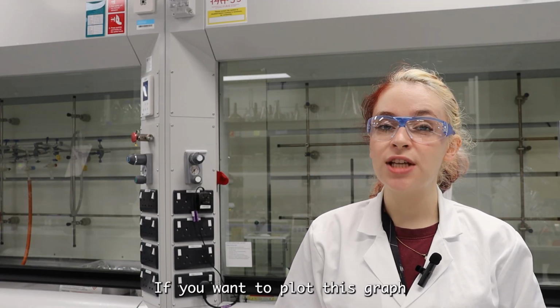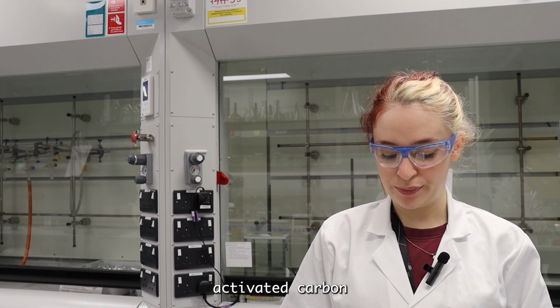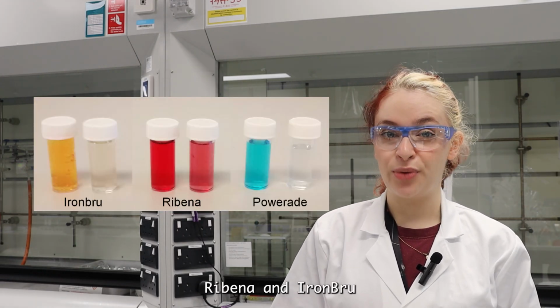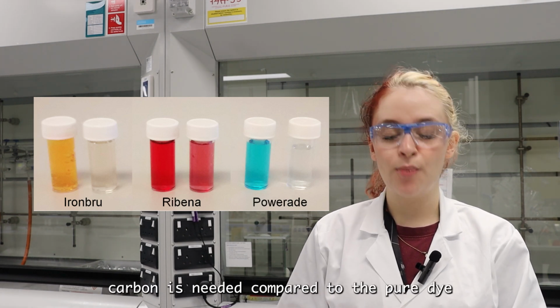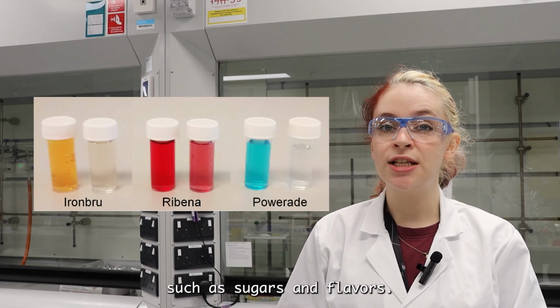If you want to plot this graph yourself, download the file from the link in the webpage. You can also try to use activated carbon to remove coloured molecules from everyday items. We have tried blue Powerade, Ribena, and Irn-Bru. We found that a lot more of the activated carbon is needed compared to the pure dye solutions. This is probably because the drinks contain a lot of other molecules, such as sugars and flavours.